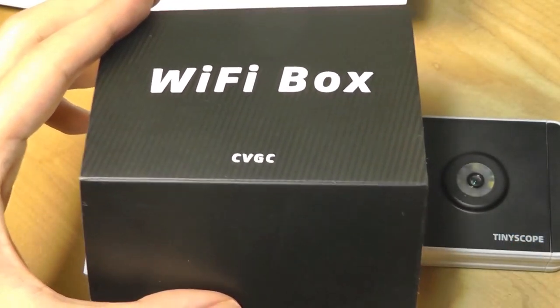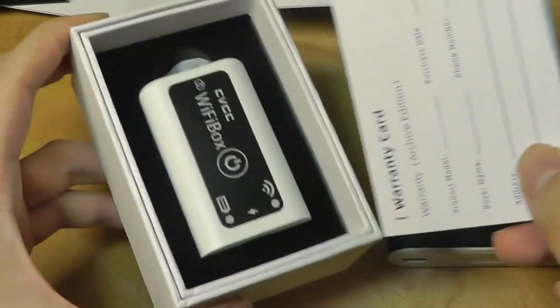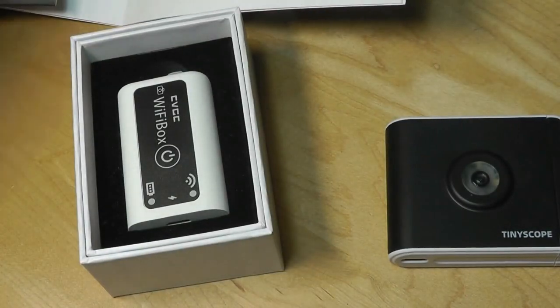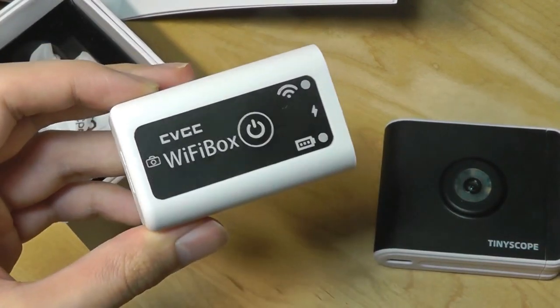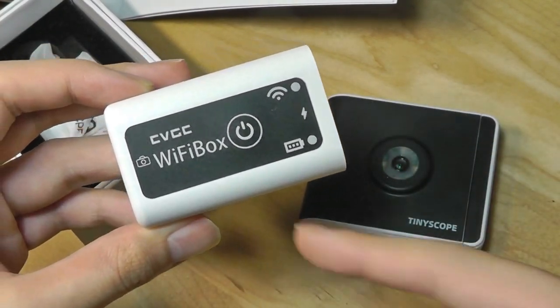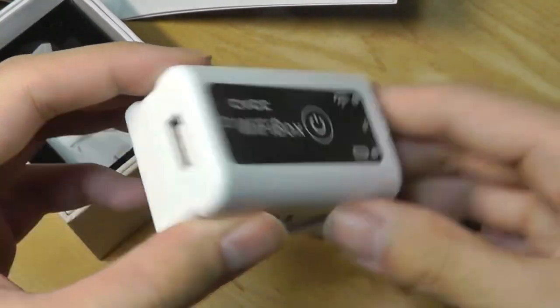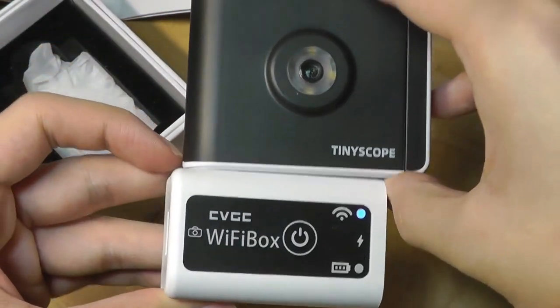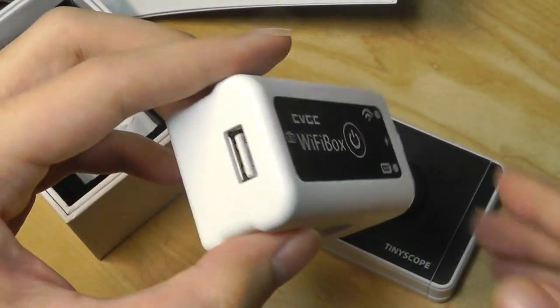We've also got the Wi-Fi box in a separate compartment — this is actually an accessory that you can pick up for about $20 more, and it allows you to have the wireless capability. It's also where the battery is built in, so the camera itself doesn't have a built-in battery. When you're connected using the USB cable, it's just drawing power from your phone. But this Wi-Fi pack not only turns on Wi-Fi after you connect the camera to the box, but it also provides power to drive the camera for a few hours at least.